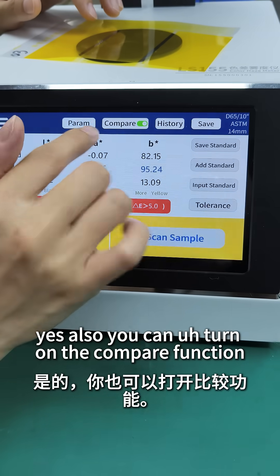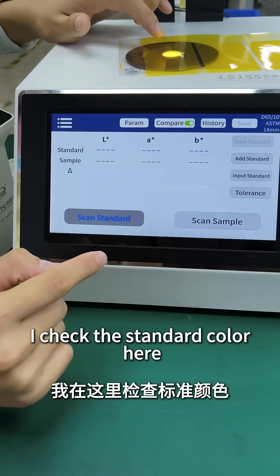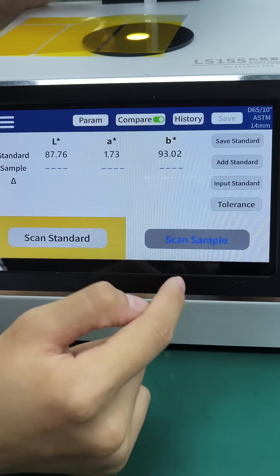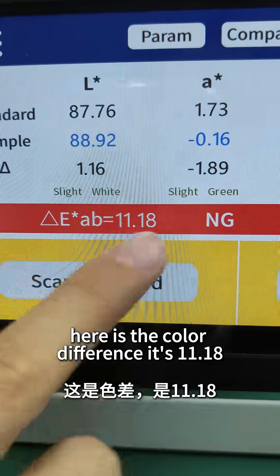Also, you can turn on the compare function. I check the standard color here, and then check the sample color. You will see the color difference. Here is the color difference — it's 11.18.